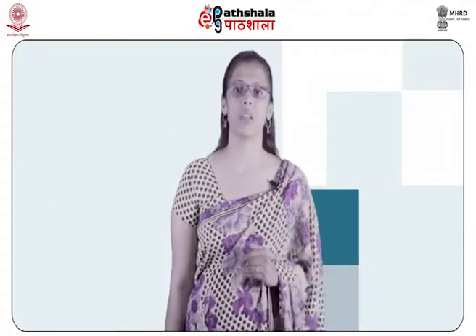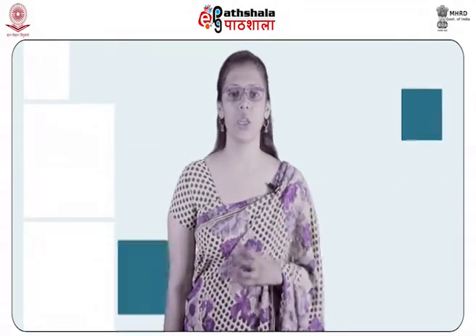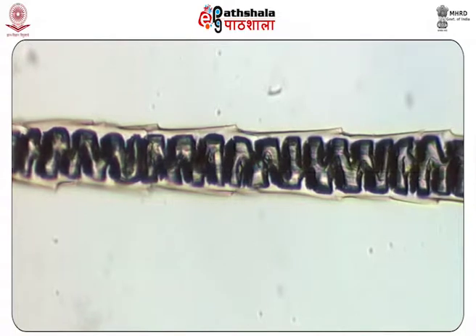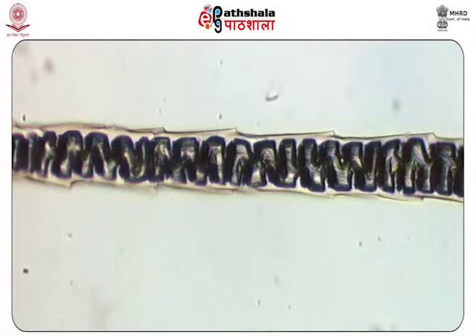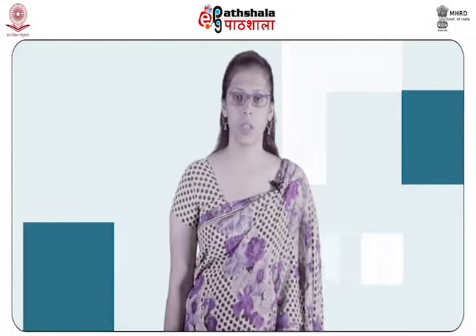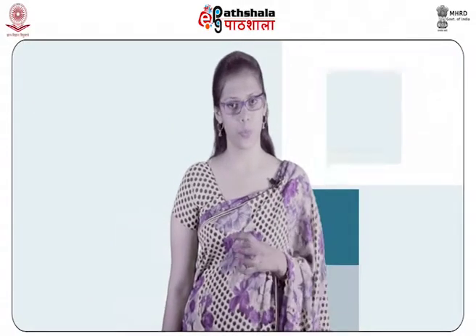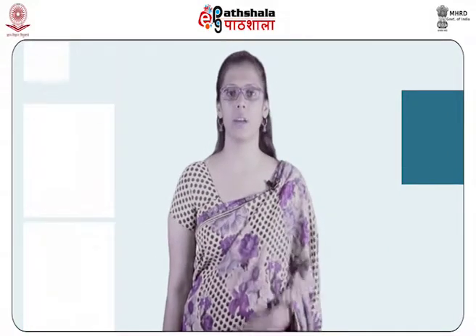This examination has provided evidence that an association may have occurred between the suspect and the victim. The inspection of mammal hairs in a forensic research laboratory is classically performed with the help of light microscopy. This scrutiny routinely includes a two-step process: the recognition of disputed hairs and the comparison of disputed and known hairs.